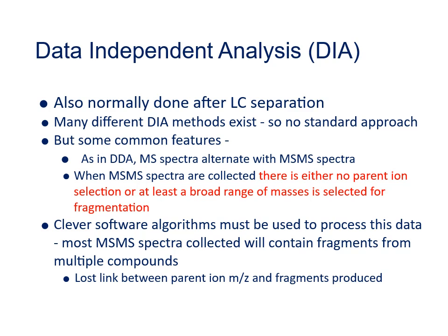Data-independent analysis overcomes this issue because in DIA the system fragments everything going through the instrument at a given time, independently of whether or not there's an intense parent ion present. So in DIA you see the fragments even from the low abundance components in your sample. But of course there's a downside to this approach.